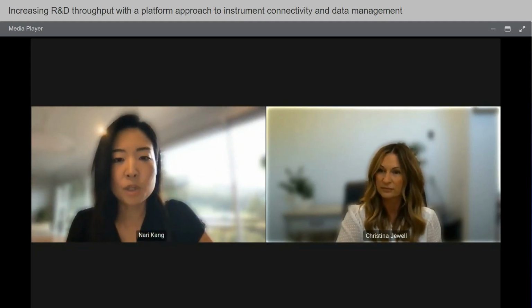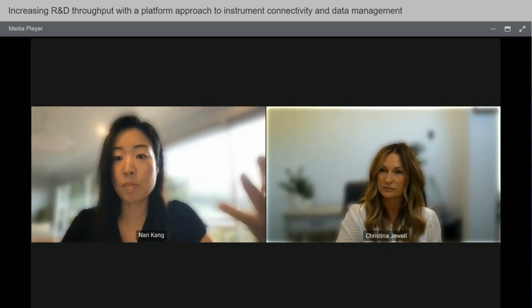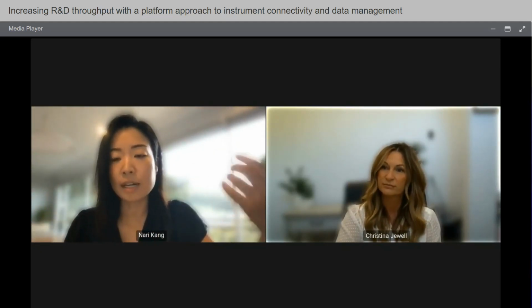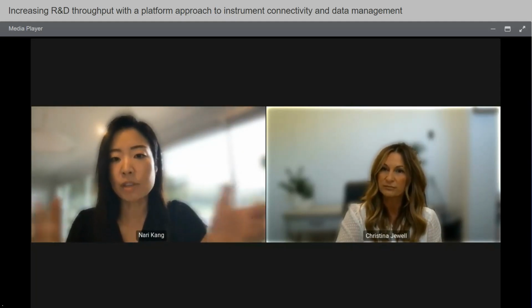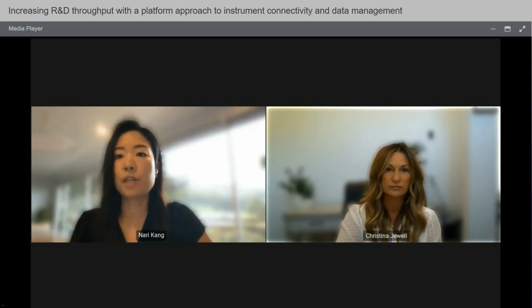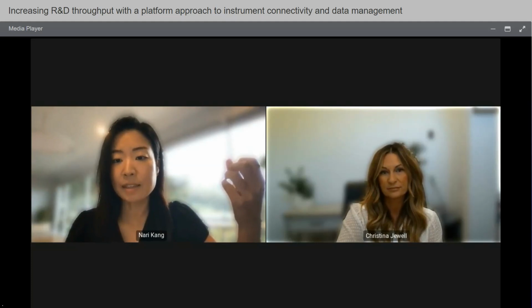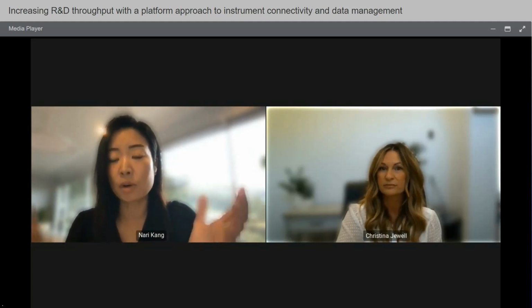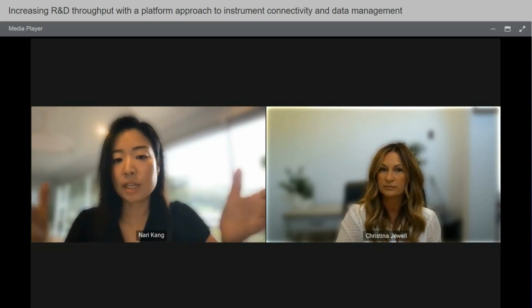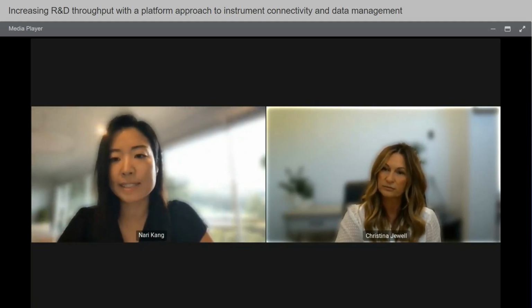So for example, you could have one connection that works with one server. The server may have multiple instrument instances. So yeah, you can definitely use one Connect to support those multiple types. And you can also configure the run to say, same instrument, but I want to perform a different assay. Then you can also configure different, what we call result schemas. So you can keep, once again, one run and multiple result schemas to manage your one instrument, but yielding multiple assays.